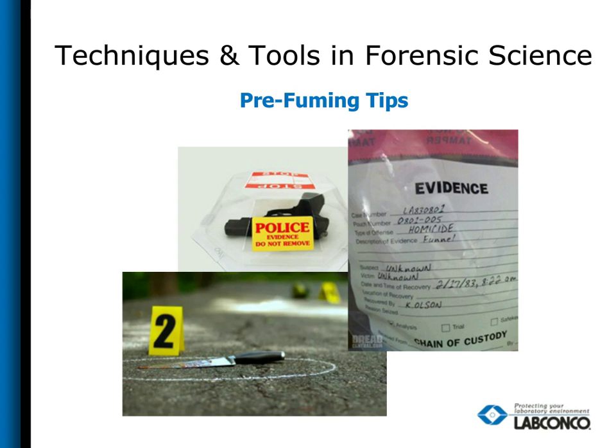Another issue that causes loss of information is drugs being packaged with the evidence that's going to be processed for latent prints later on. Separating these types of evidence from the packaging early in the process helps increase your success rate later on.